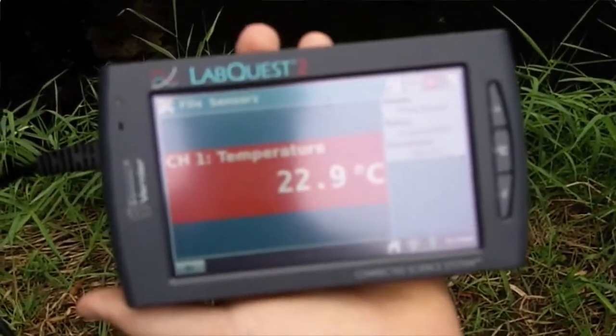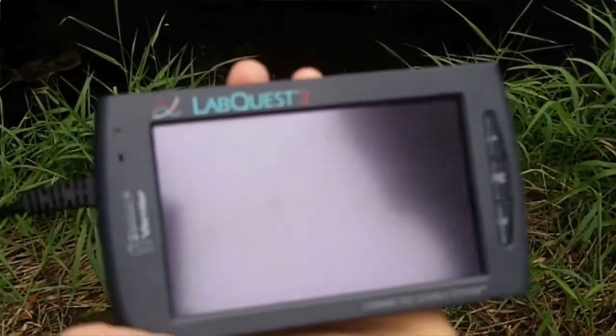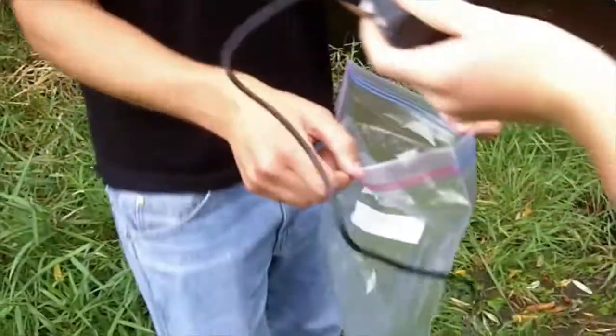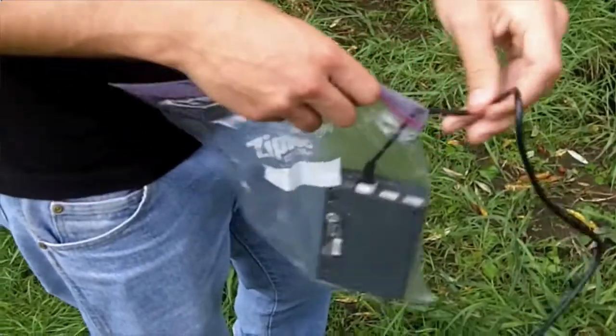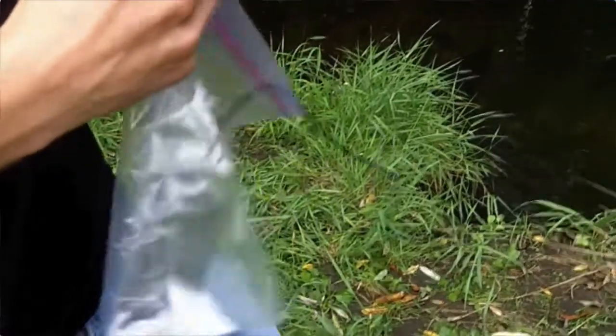The next step is we want to actually measure the water temperature. We have to put the LabQuest 2 in a plastic bag just to be safe. Hunter is going to put that in the plastic bag and seal it up as best as possible. There's going to be a little space obviously where the cord comes out.